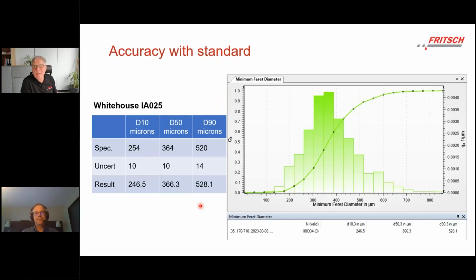Thank you. Maybe a quick comment from my side also. Jeff basically covered everything. The typical answer to this question, what is the accuracy of this method, is that it depends on your sample. If you have a nice sample, the right size range, you have chosen the correct lens, and you have good feeding conditions, then it is very, very accurate.